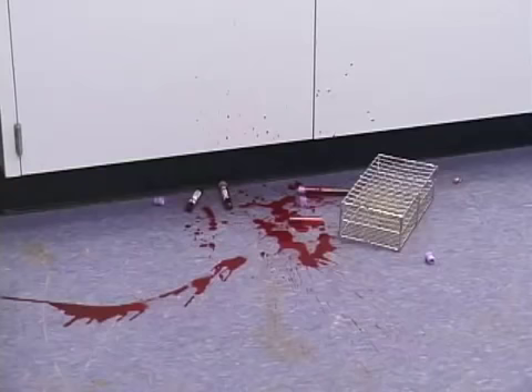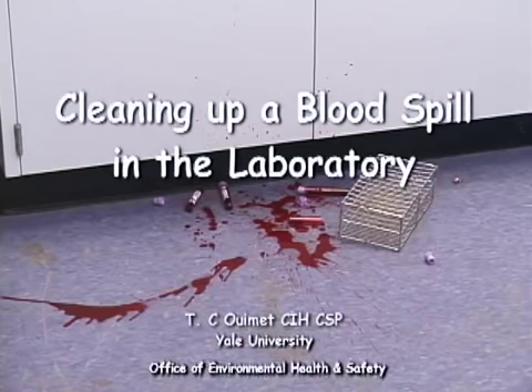Large spills of blood and other potentially infectious materials occasionally occur in laboratories and are typically cleaned up by laboratory personnel. If you should experience a spill of this type, follow the procedures described in this video.